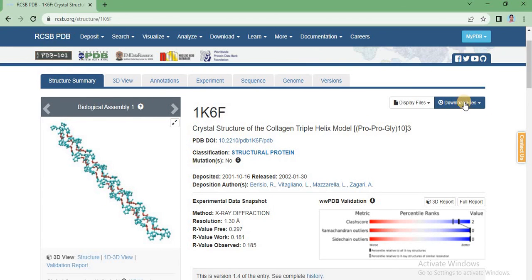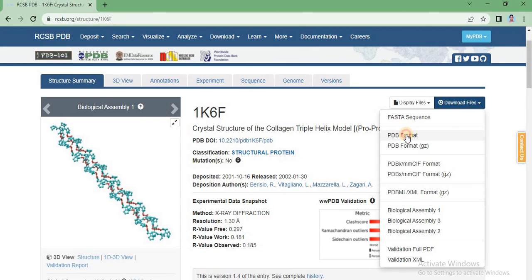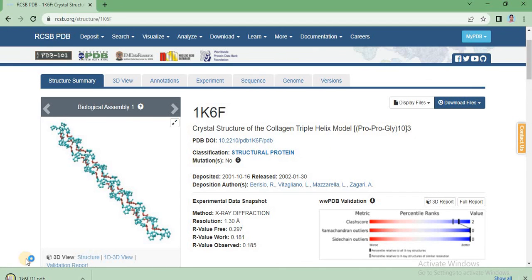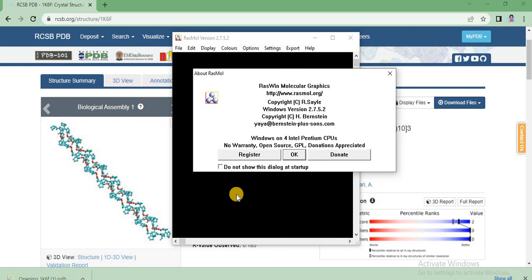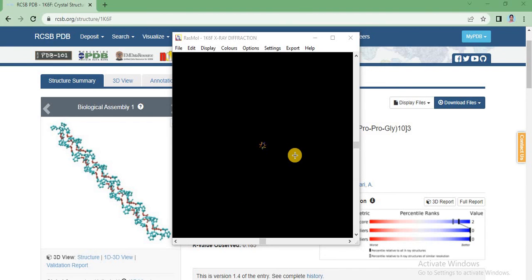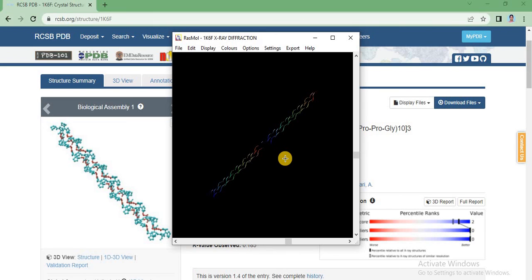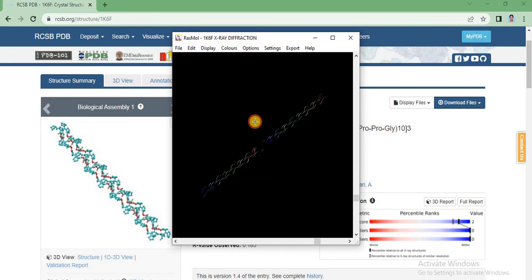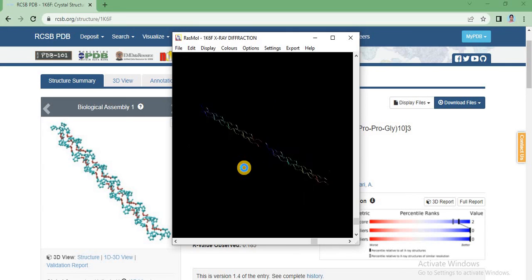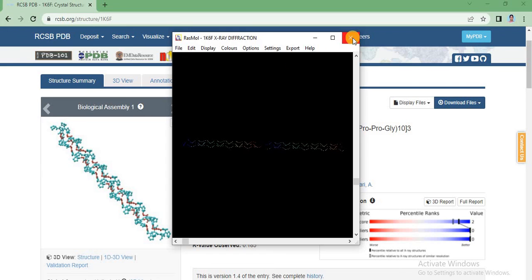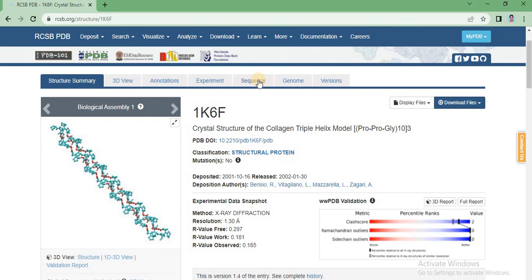Now we download this structure. Click 'Download Files' and select PDB format. The PDB file will be downloaded. You can open and check it. This protein structure can be visualized using molecular visualization tools such as RasMol. This is all about accessing the PDB website and downloading a protein structure. Thank you.